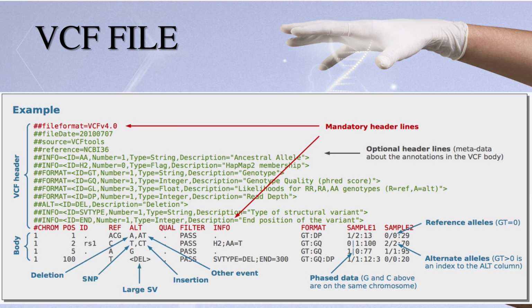The metadata lines prefaced by INFO furnish the descriptions and anticipated values for these annotations. Moving on, lines starting with FILTER outline the filters applied to our dataset. Lastly, lines beginning with FORMAT mirror the structure of INFO lines. To elucidate, when detailing a sample, information within the data lines encompasses annotations such as genotype quality, read depth, and related information, each assigned a specific value. Descriptions of these annotations and the expected values are elucidated in the metadata section through lines prefaced by FORMAT.